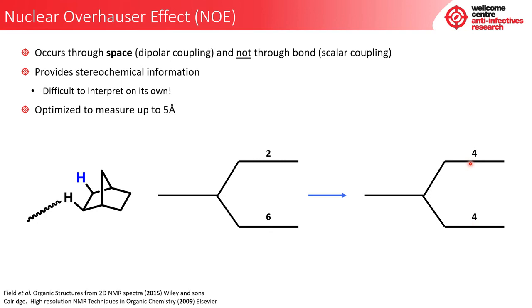Now, in previous talks that you have learned, NMR is all about measuring the difference between something, often referred to as relaxation. It measures the difference in relaxation. And here what you can see is that the NMR will show this as something that is silent. It can't see what is occurring. But when we switch this pulse off, this state starts to revert back to its happy state again. And this is what the NMR can measure, i.e. it's all about relaxation.